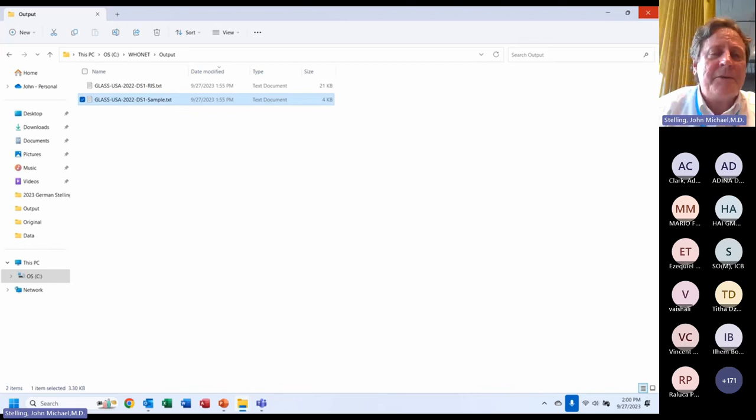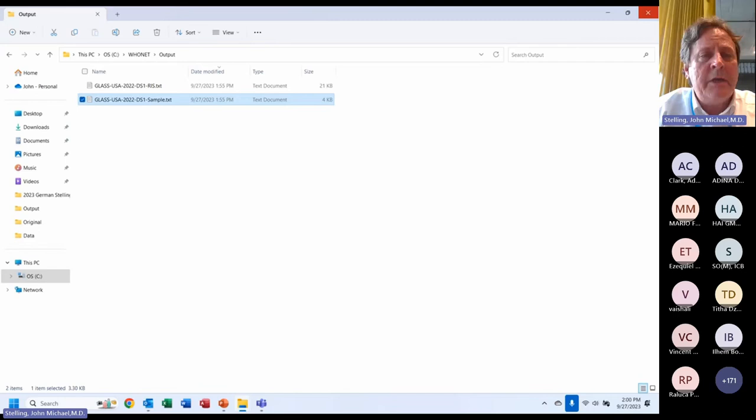I have shown you how to export from WHO Net to the GLASS RIS and samples files. I'll now ask Barb to take over, and she has her own files she will use for the demonstration.